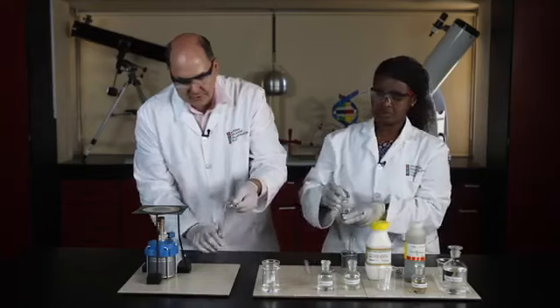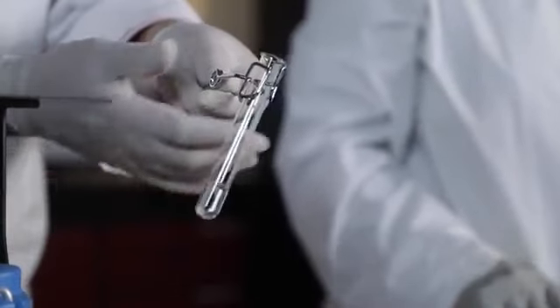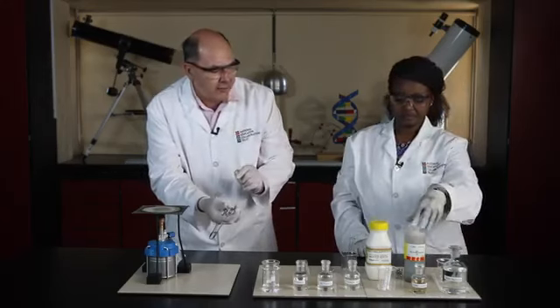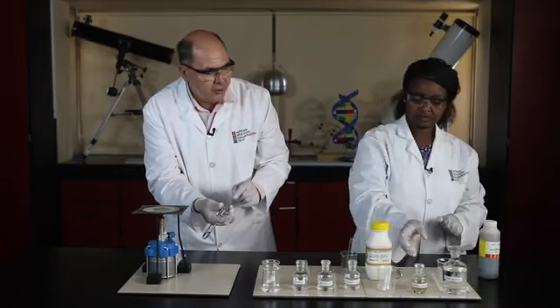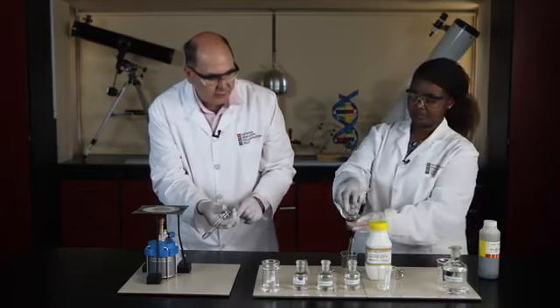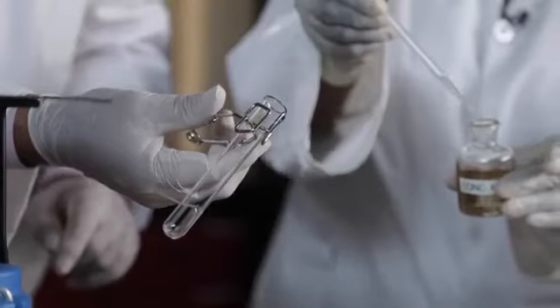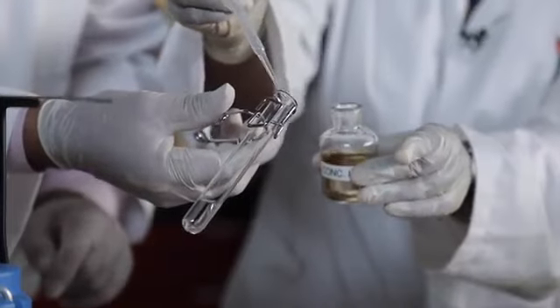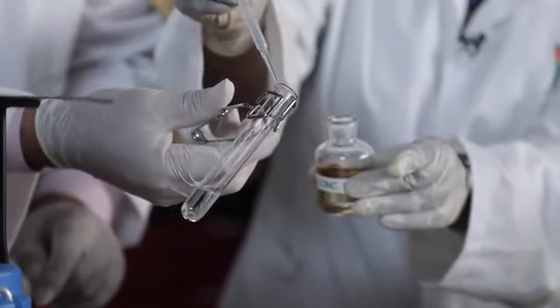Let's swirl it around. There we've got our carboxylic acid and alcohol. We need to add our catalyst. The catalyst is concentrated sulfuric acid. So we need to work very carefully now. So only 2 or 3 drops of concentrated sulfuric acid. We're going to run it down the side of the test tube and hopefully that will get the reaction going. There it's sliding down. It's 1 drop.